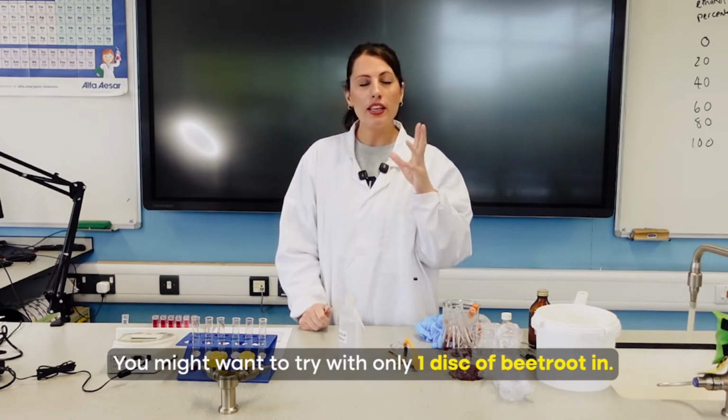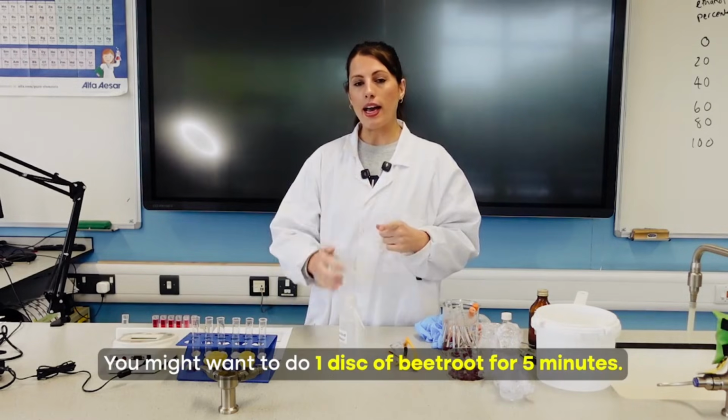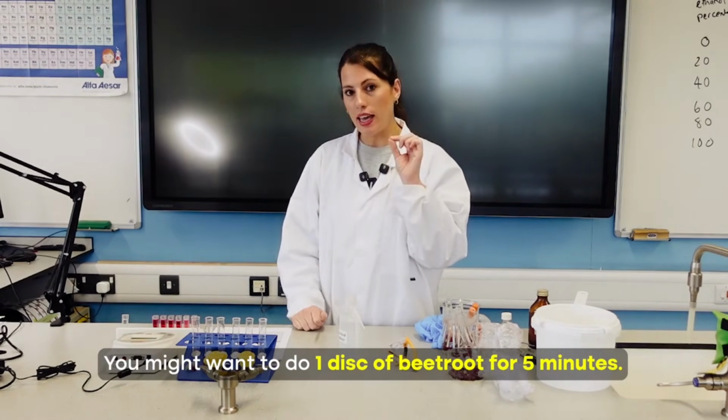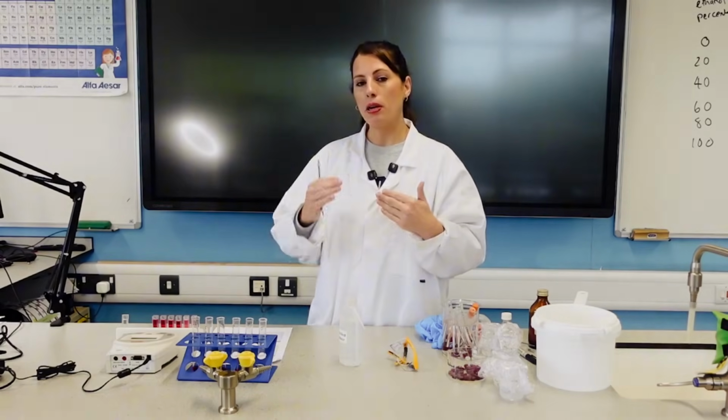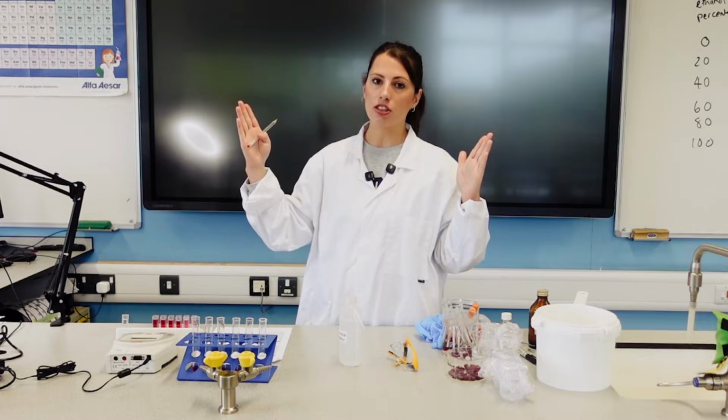I left it for, in the end, I think it was actually about 7 minutes before we got to the point of pouring it all out. So you might want to do 1 disc of beetroot, 5 minutes. What that will mean is you'll get less pigment coming out, but it might mean that you don't hit that top amount and you will get that full range of results.